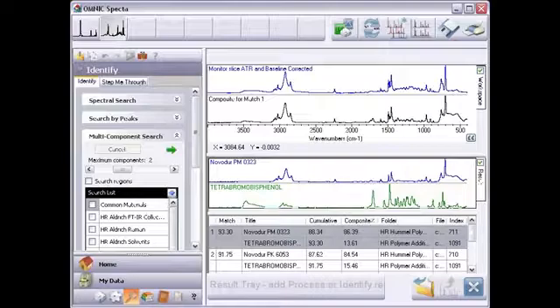Remember that unlike other search techniques, this algorithm does not depend on residual spectra, so we avoid introducing artifacts and distortions through spectral subtraction.